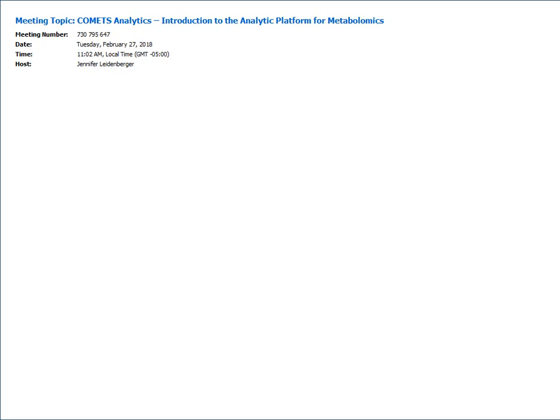We found that each lab, in addition to including their own name and a standard chemical name, will usually include at least 2 to 3 unique chemical identifiers from online databases. They're not all the same across labs, but there's enough overlap that if you have all the files in hand, you can put it together like a puzzle. If A links to B and B links to C and so on, you can link all those unique identifiers to get one master list.